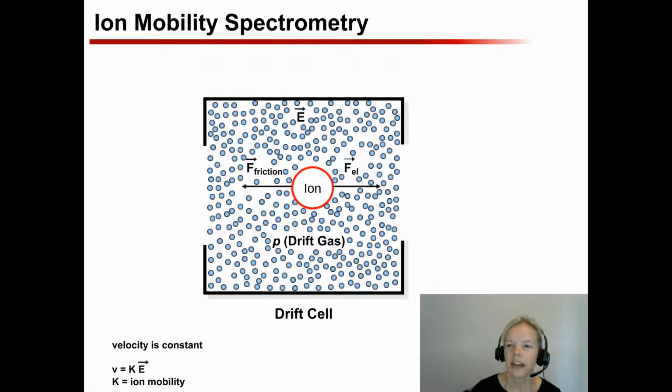And the specific ion mobility spectrometry analysis we use is drift tube-based ion mobility spectrometry. And in drift tube-based, we have a tube that's full of an inert gas, and we like to use nitrogen for that because it's renewable.